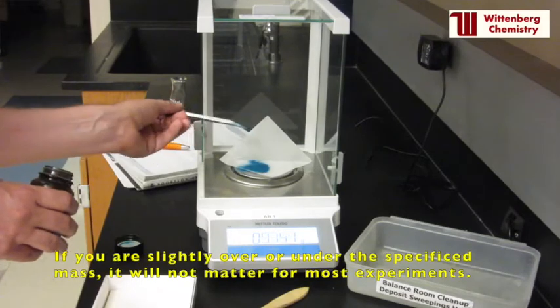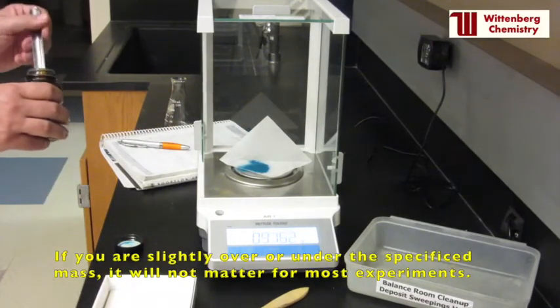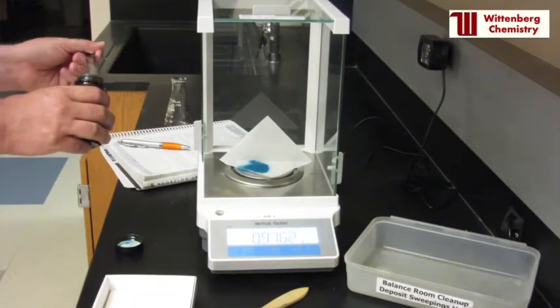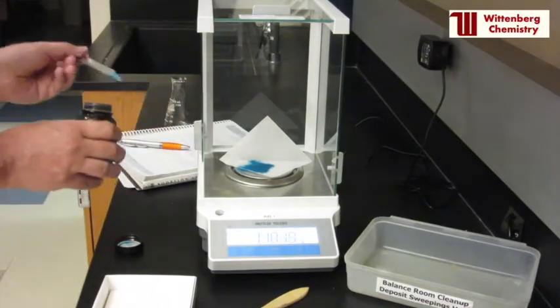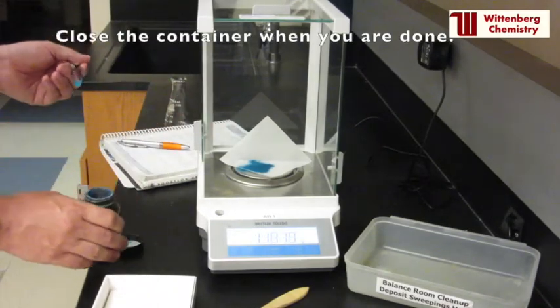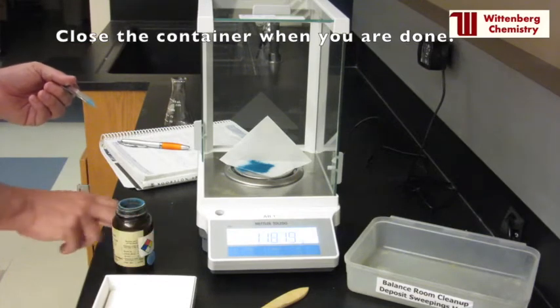For most experiments, you do not need the exact mass written in the laboratory manual. It is okay to be slightly under or over the listed amount. Close the reagent bottle when you are done weighing your chemical.